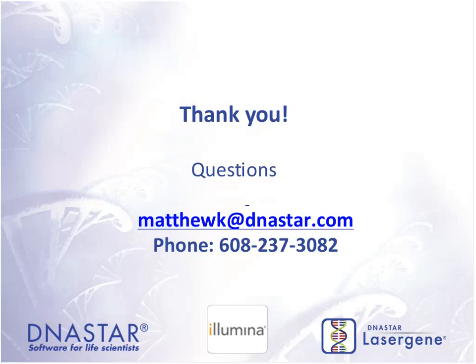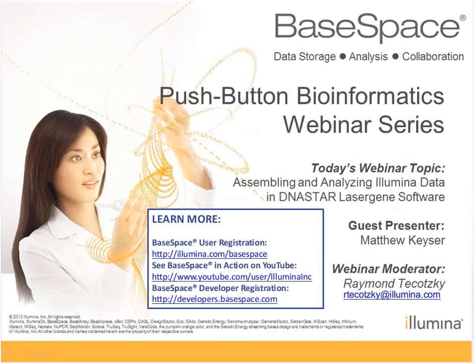Okay, another question. Why BaseSpace? What is the reason that DNAStar has embraced the cloud and specifically put their engine application on BaseSpace? Well, we think that there's a number of obstacles that next-gen customers and Illumina customers face, and a lot of it is just logistics. How do I get access to my files? They're fairly large. They can be difficult just to transfer up and down on the network. With BaseSpace, everything is set up perfectly so that you can move your data from the sequencing instrument right over to BaseSpace.